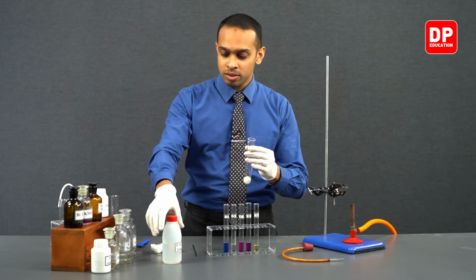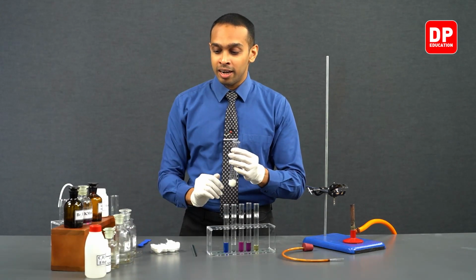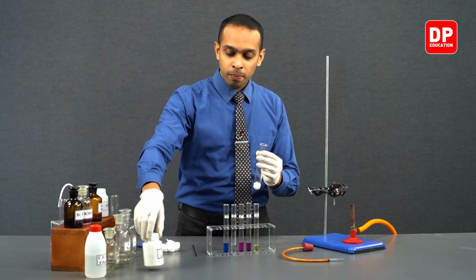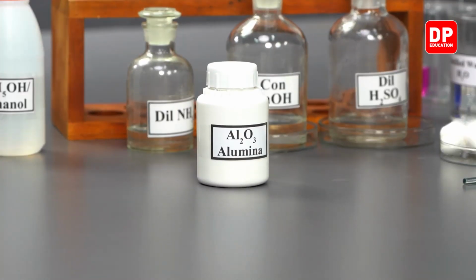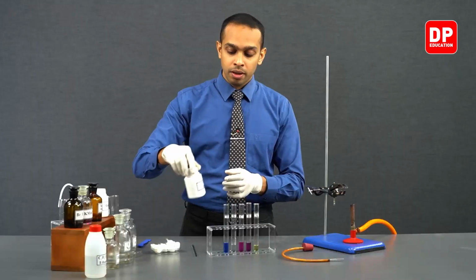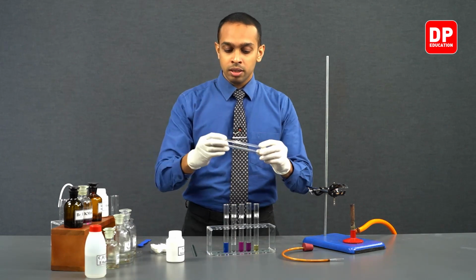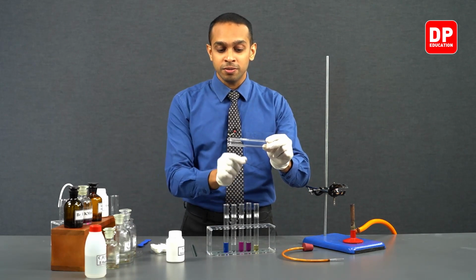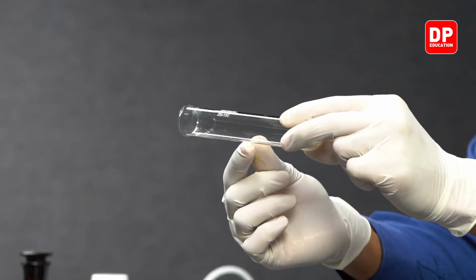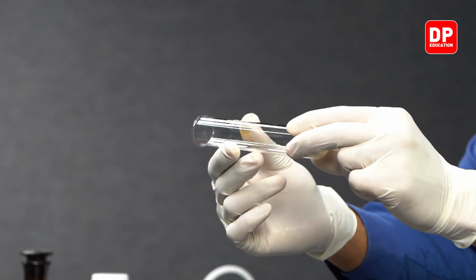So now let's move our ethanol and let's take our alumina or aluminium oxide, and we have to take a small amount of alumina and place it on the boiling tube here. We have to make sure the alumina is present in the middle of the boiling tube, somewhat close to the cotton wool.